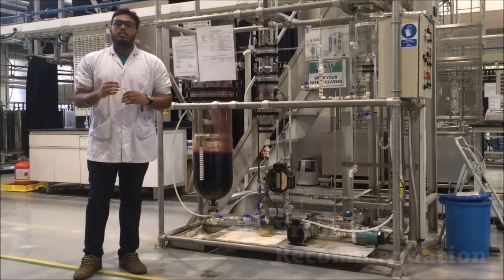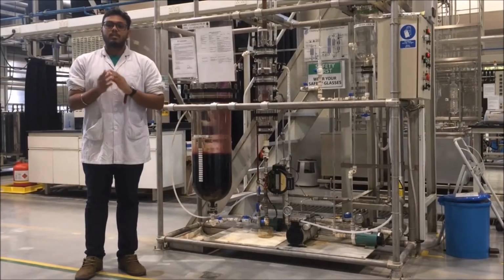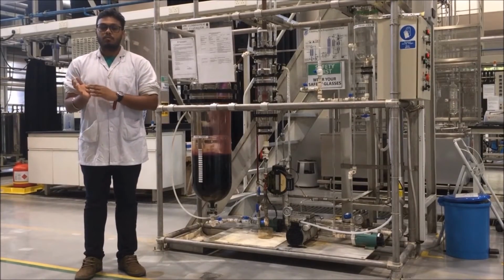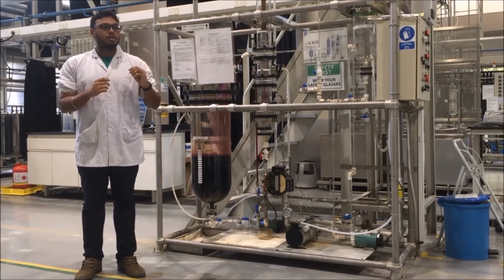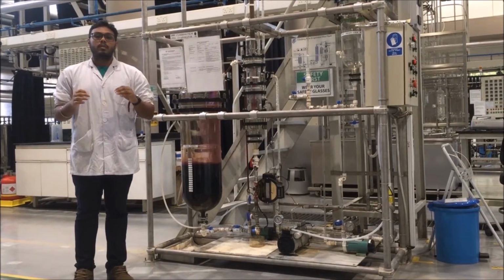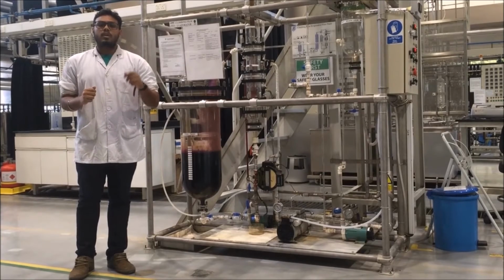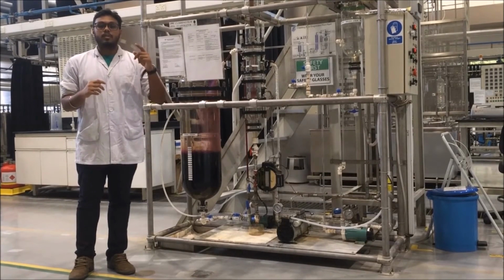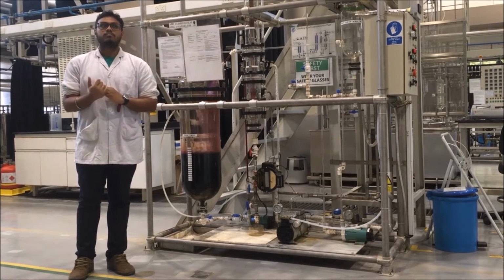Now I will be doing the errors and recommendation part. First, to measure the correct value of the volume of the condensate, we have to make sure that the condensate solution is transferred fully to the receiver. This can be done by allowing the condensate solution to go to the inlet pump and then be pumped back to the receiver completely for the solution to be taken.